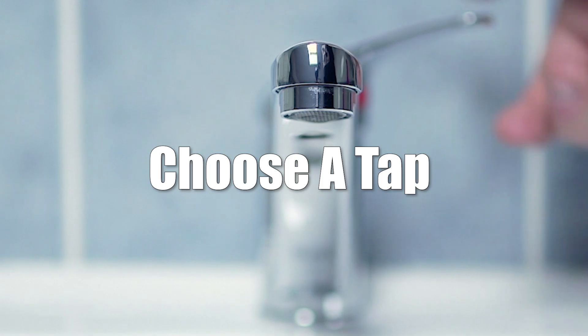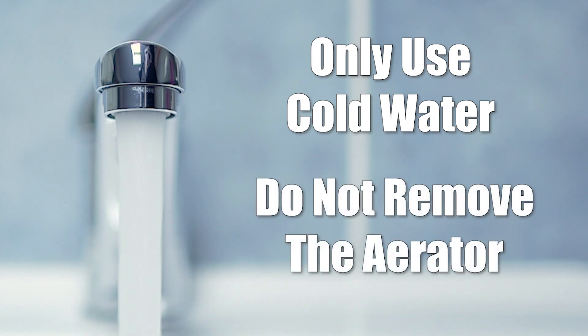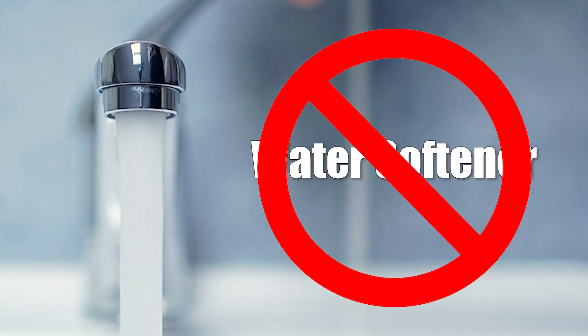Next, it's time to choose a tap for your sample. When taking a sample, only use the cold water line of a kitchen or bathroom faucet, and make sure not to remove the aerator. If you have water softeners on your kitchen taps, collect your sample from a bathroom tap that's not attached to the water softener.